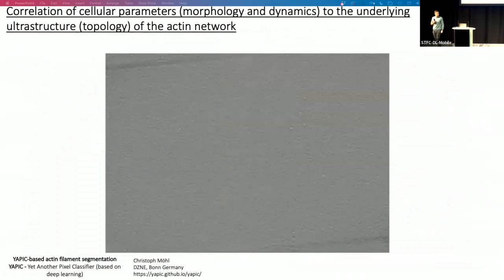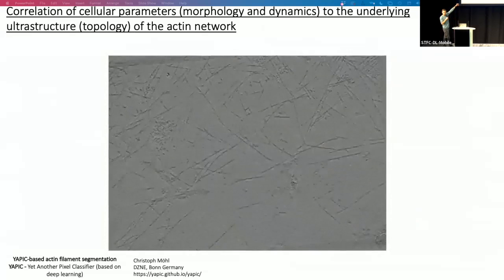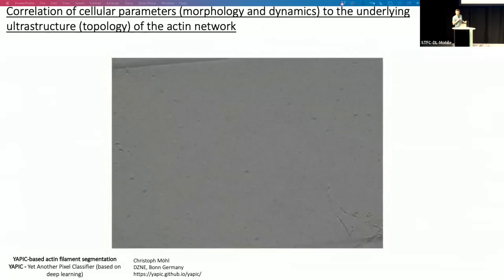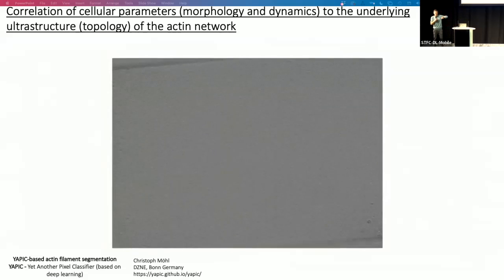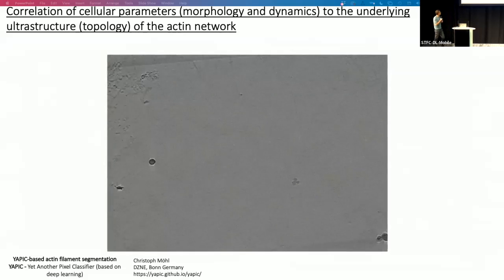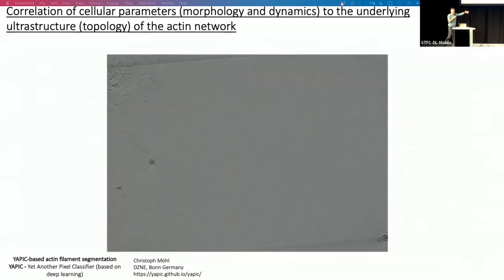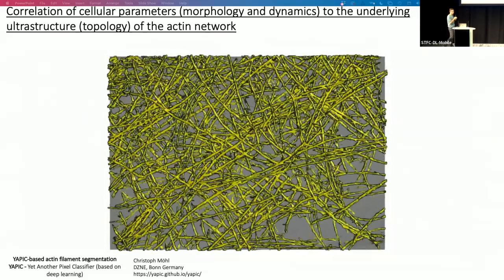what's going on? And this is where we now face the problem. How do you go from this nice data to quantitative information that describes it? Because this is just gray value data, but you have to somehow vectorize that information. And you have to then take this vectorized information and compare it across data sets. And we tried around with neural networks to segment this data, which you can see here. Super chaotic, works very well though.